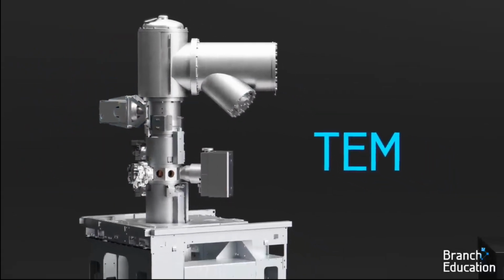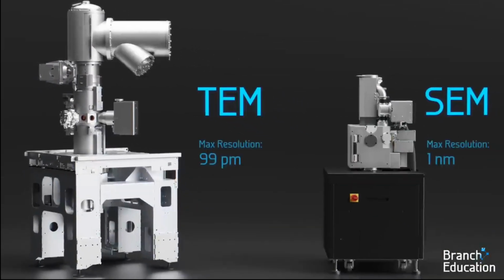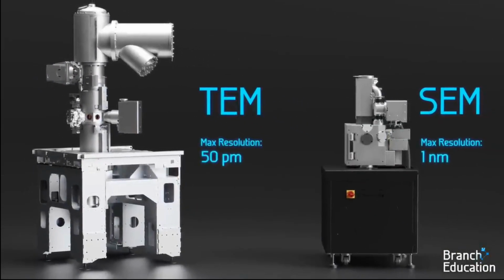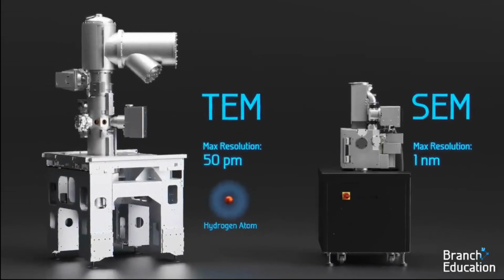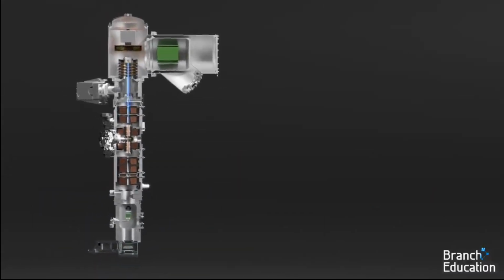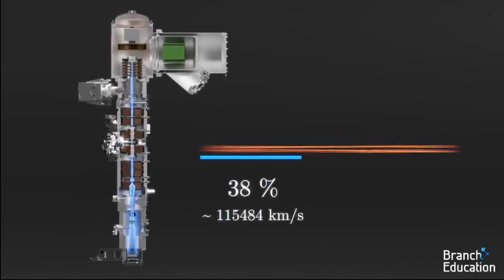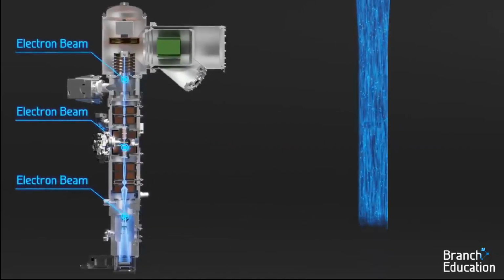Transmission electron microscopes are typically more complex than SEMs and have a resolution up to 50 picometers, which is roughly the size of a hydrogen atom. One quick note is that the TEM generates electrons and accelerates them to around 70% the speed of light, thus creating a beam of electrons.